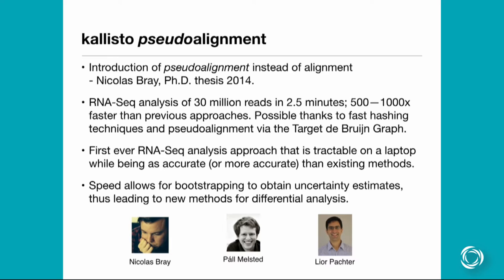So I gave a demo doing Jasper Ryan's data set, or someone from his group, Aisha Alahi, has this really interesting data set with SIR2 knockdowns in yeast. I gave a demo 2 or 3 weeks ago where I actually analyzed 6 of the samples on my laptop, and then did a Shiny demo with it as well, within a 10-minute talk. We basically did the whole analysis on my laptop in about 4 or 5 minutes. So it's quite fast.